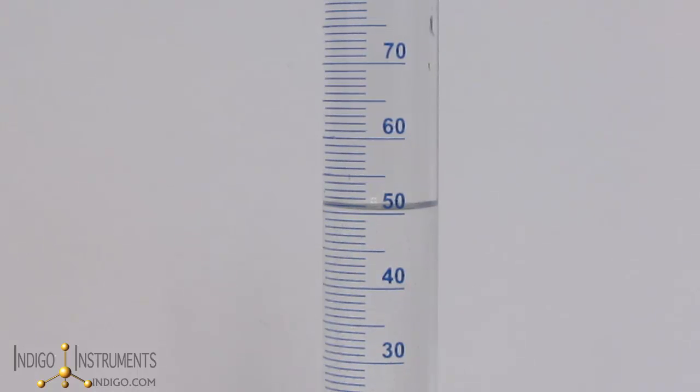In this instance, we are showing the measurement at the 50 milliliter mark. The 1% accuracy is still maintained and is in fact exactly 1% here at 50 milliliters.